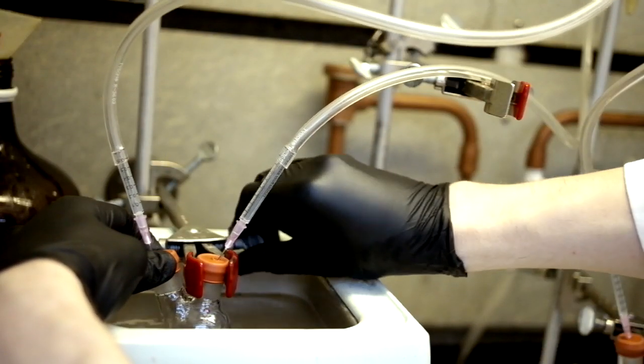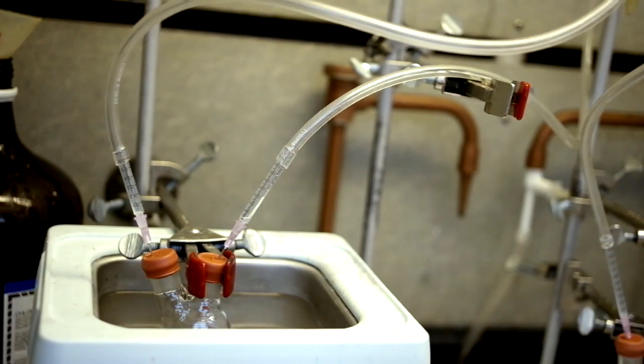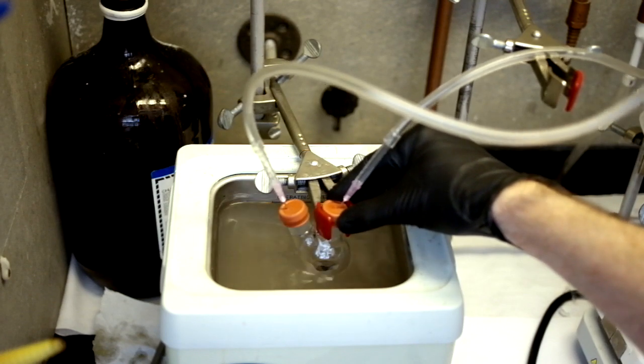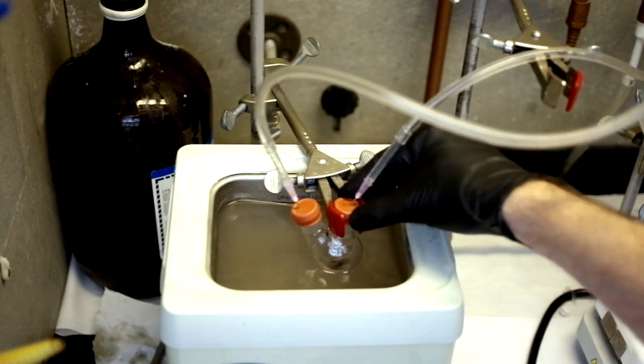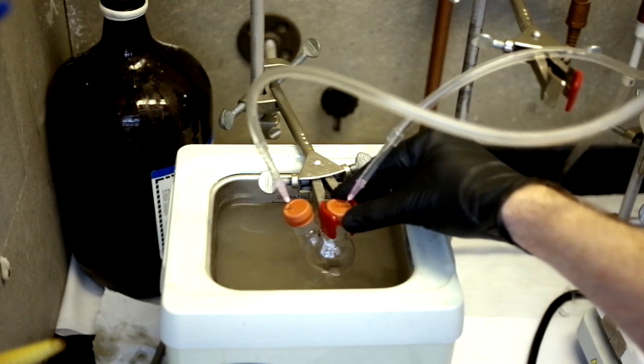Place the precursor flask into the sonicator and sonicate for several minutes until the selenium completely dissolves. It will be necessary to shake the flask several times during this process to ensure that all the material is completely dissolved.